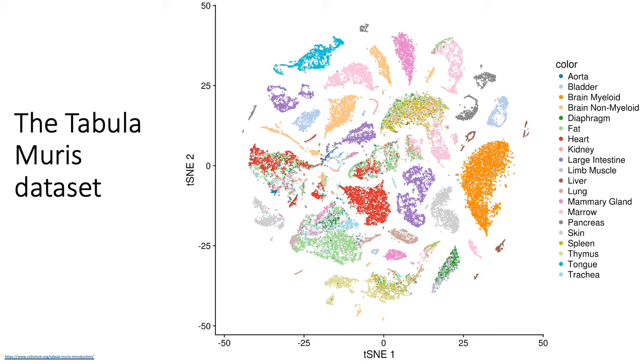These methods like t-SNE and UMAP tend to do a better job visualizing data compared to PCA because they're what's called nonlinear dimensionality reduction techniques. But they're less interpretable in the sense that we don't actually know what these individual axes mean. And so basically one of the points of visualizing your data is to see how cells cluster in your dataset. So here again, I mentioned that each point represents an individual cell.